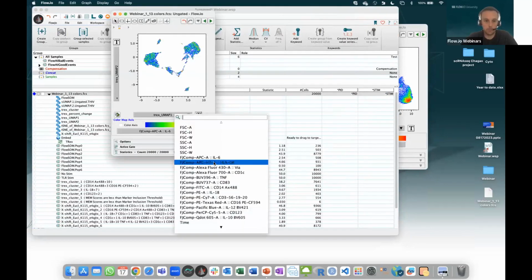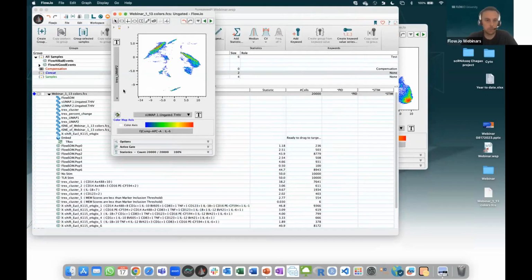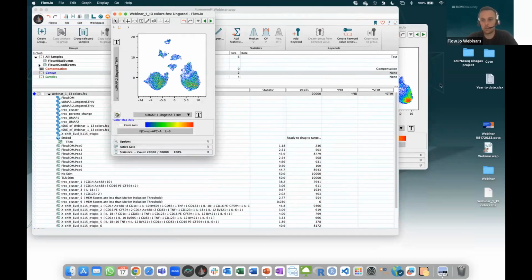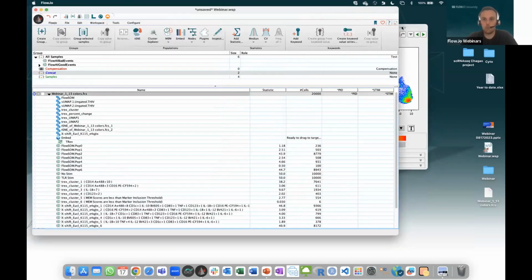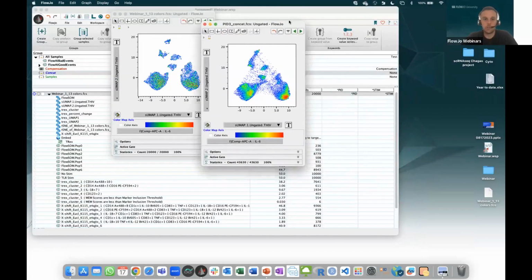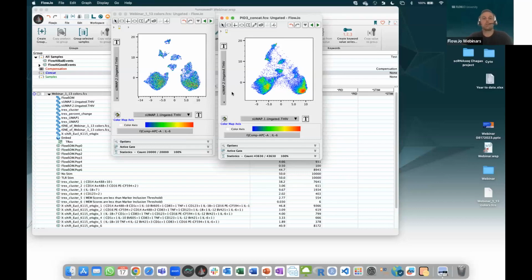So here it's not the same UMAP, it's this one that I use, UMAP 1, UMAP 2, and where it falls in those clusters compared to that one. So see that, oops, sorry, up there, you see that all the clusters are present in this patient ID 3, same as my other patient.